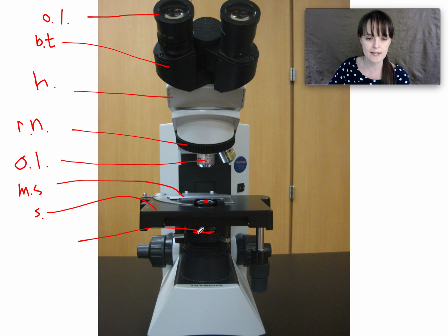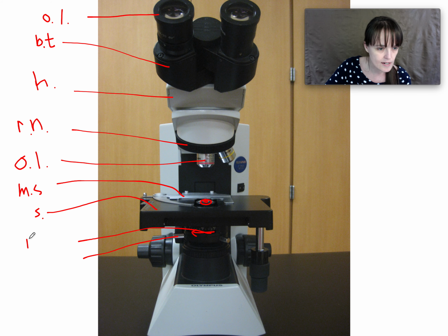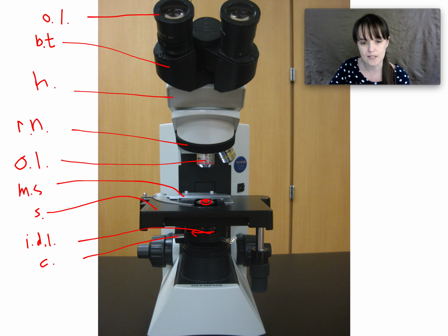And then you slide this open, and then that opens that aperture, and then you have a larger circle of light. It affects the focus. And so that's the iris diaphragm lever. And then that's the knob for the condenser. These both are knobs for the condenser. The condenser is inside there. The iris diaphragm is inside. You can't see it, but you control it with a little plastic lever. The condenser knobs are silver.